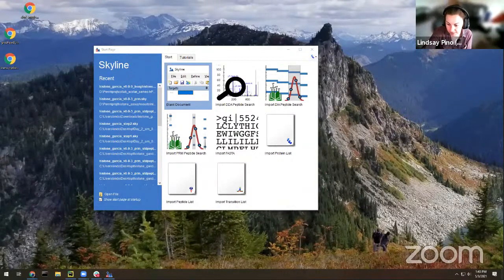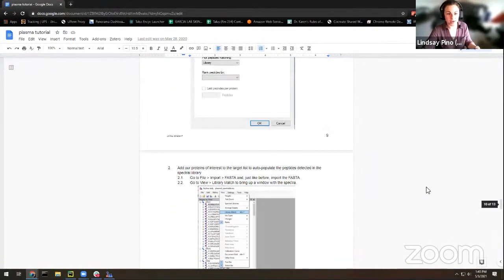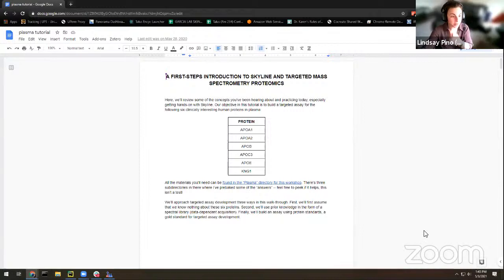For this tutorial, we're just going to do kind of a pretend example. This is really to get you familiar with the Skyline software, because tomorrow Brendan's going to take you into the deep end and go straight to analyzing DIA data. So let's build a little bit of comfort using Skyline. In this little mini tutorial, we're pretending we're doing a targeted analysis of these 6 different plasma proteins. So let's imagine your boss says, I want an assay for these 6 proteins, or let's say you want to go back and reanalyze some plasma DIA data.